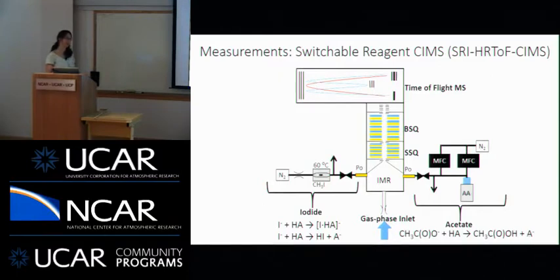So using acetate ionization allows us to access and measure carboxylic acids in the atmosphere. Iodide is a little more general. It measures some carboxylic acids, but it has also been demonstrated to do beautiful measurements of various peroxides and other types, and nitrates, and other molecules.